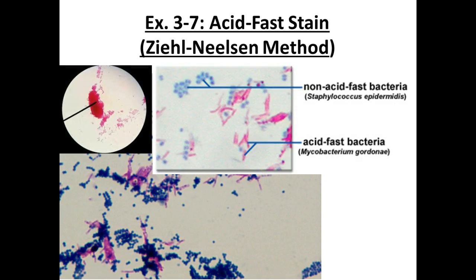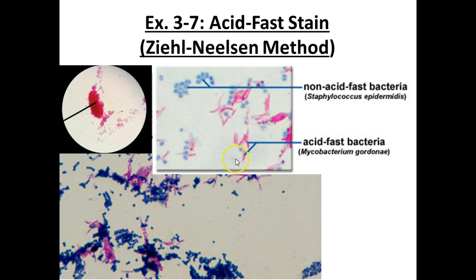Here are some examples. You'll probably see them really clumping together. Sometimes they're going to almost look coccus-sized just because the rods have kind of shrunk up. Go to the edge of the clump where you can see individual cells. We have a mixed culture, so you should see both — Staphylococcus epidermidis as bluish-grayish cocci in clusters, and hopefully you will also see the acid fast organisms. You're going to have to scan around on your slide to see both organisms, and hopefully you'll see both colors.